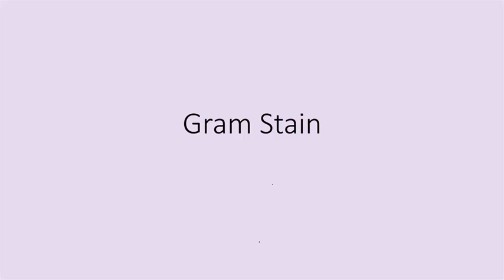In this presentation, I'm going to show you some images of bacteria that were stained using the Gram stain, and I'll also explain how this process of the Gram stain works.